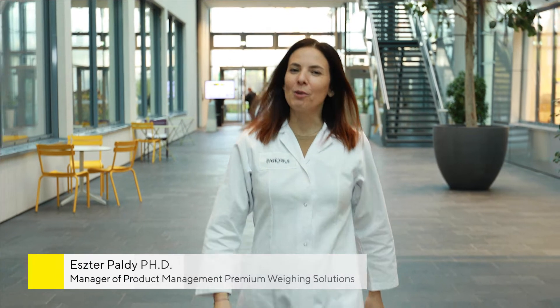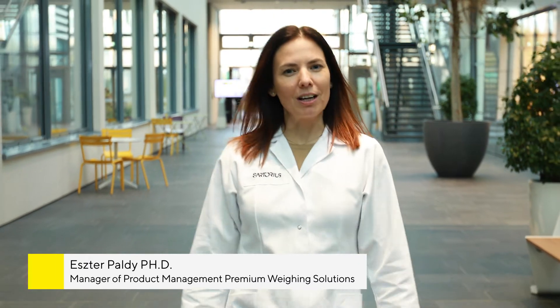Hello, today I'm going to walk you through the cleaning of our new QBIS II Ultra High Resolution Balance. We know our users have a lot of questions about the proper way to clean their balances — what chemicals are okay to use, what parts can be removed for cleaning. These are all relevant questions, because with high resolution balances, even a small amount of leftover residue can impact your weighing accuracy.